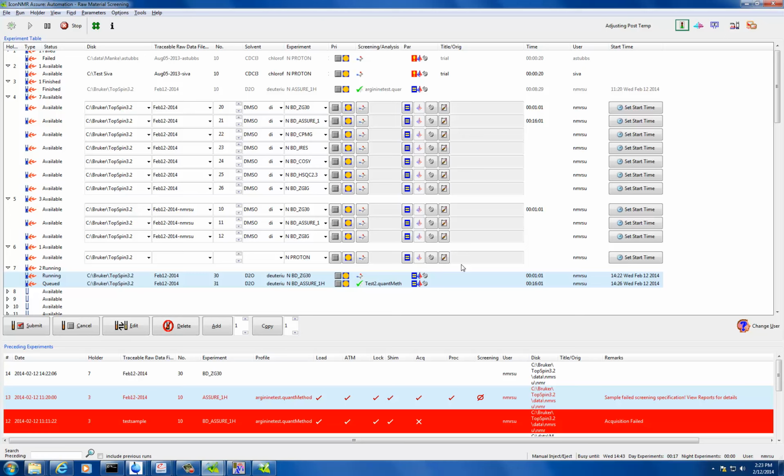He set up a method about all the solvents and all the main compounds inside, right? Yeah, you can do that if you want to. So every time before we run a sample, we need to set up a new method with the information for our sample, right? Yeah, for sure.